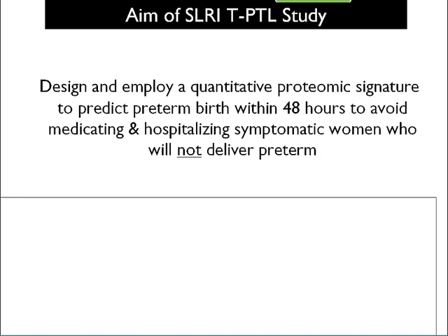Before mom is going to give birth, baby has to know that, and baby has to tell mom what's going on too. So these white blood cells apparently wander through the placenta, and they share molecular information between mom and baby. So Stephen's postdoc, an excellent researcher called Jan Heng, has gone through and designed a SWATH workflow.